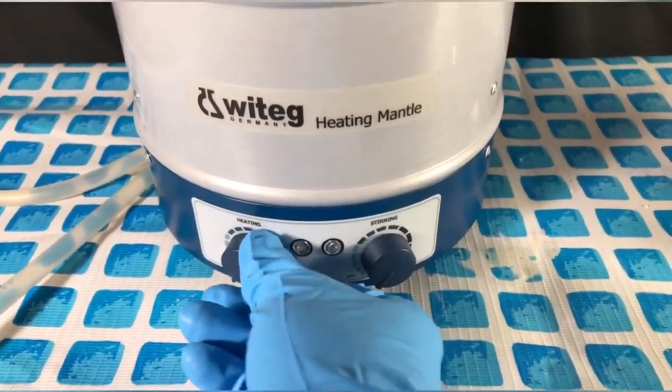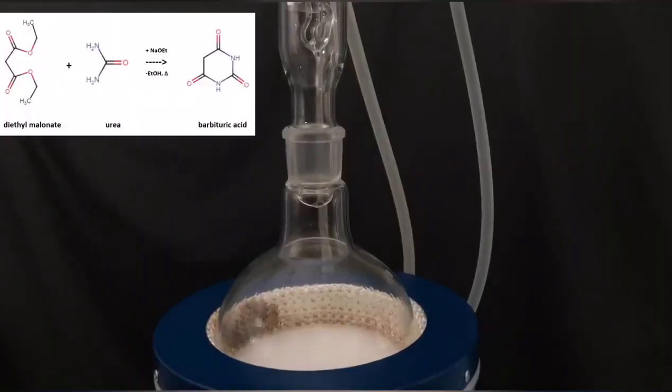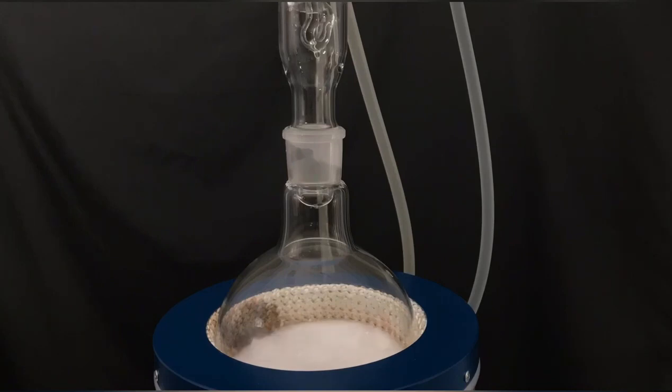To get the reaction going, heating and stirring of the heating mantle were turned on. The reaction taking place here can be seen above. The diethyl malonate reacts with the urea, catalyzed by sodium ethoxide to form barbituric acid. For every mole of diethyl malonate consumed, 2 molecules of ethanol are split off. We allowed the mixture to reflux for 7 hours.